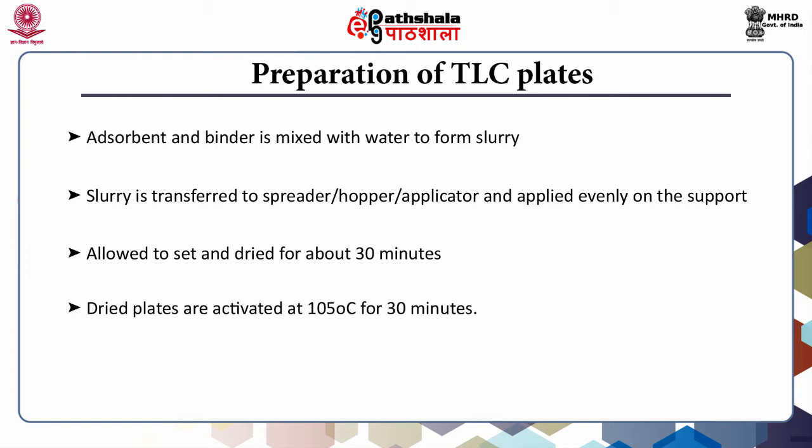However, commercially manufactured pre-coated TLC plates are available nowadays. Sometimes you will find a fluorescent indicator is also added in the adsorbent material, which ensures that the separated spots are visible under UV light, that is 254 nanometer. So, the silica plates with binder and the fluorescent indicator are denoted as silica gel GF.